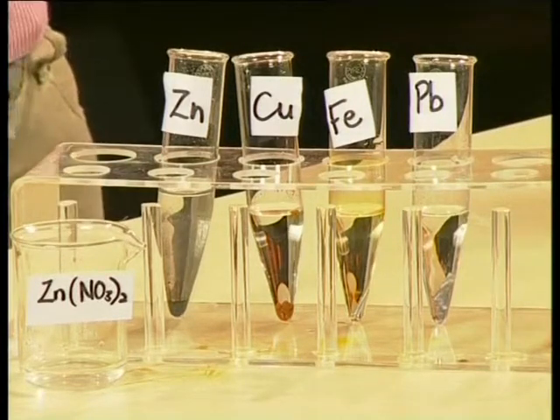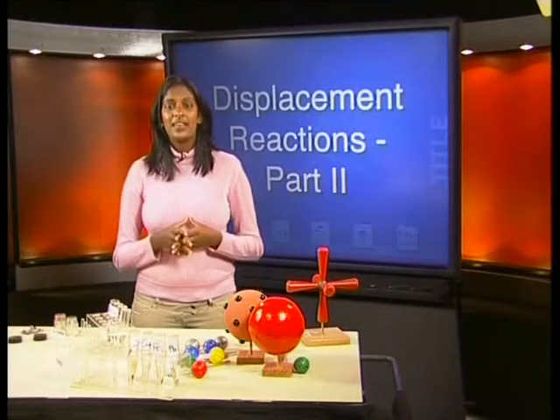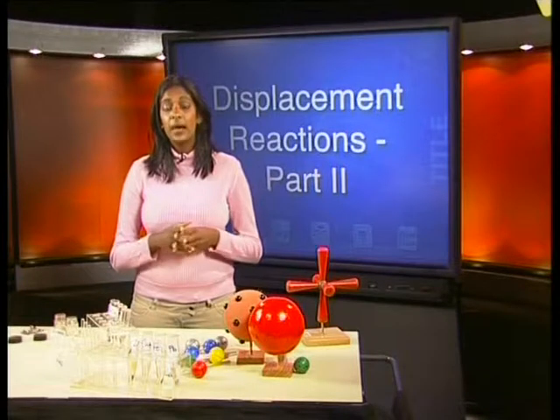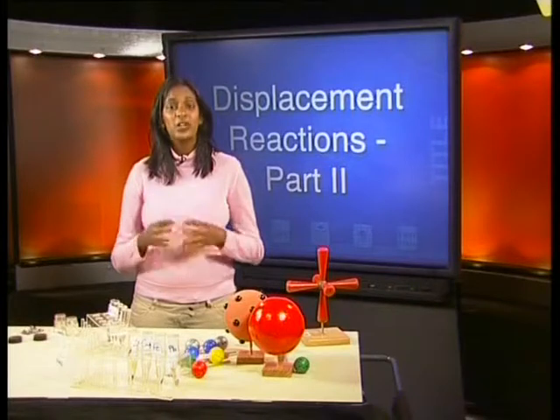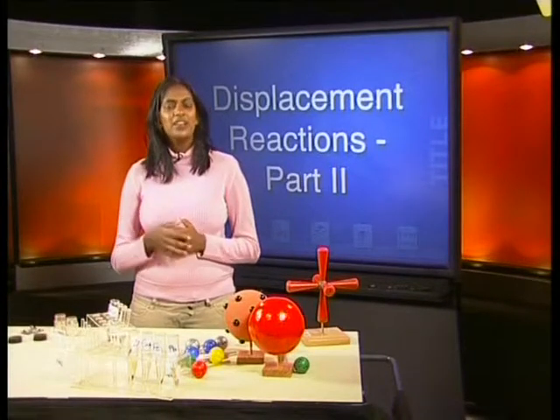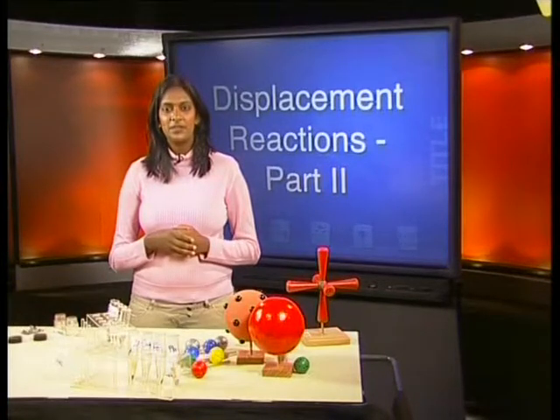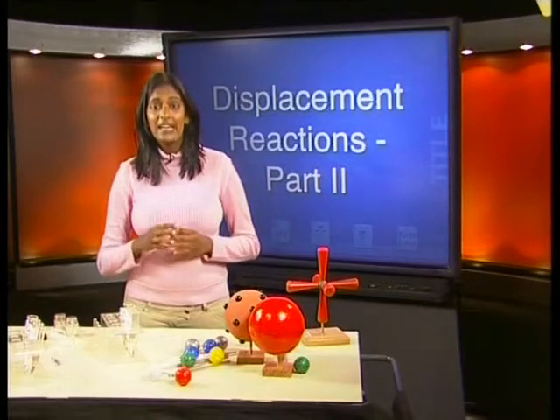What does this mean? Well, the most obvious conclusion that we can make is that no reaction took place in any of the test tubes. This means that none of the other metals are more reactive than zinc because they could not displace zinc from its salt solution. The last set of test tubes we prepared contains the lead 2 nitrate solution. Let's see if any reactions took place in these test tubes. Remember, lead 2 nitrate is also a colorless solution.